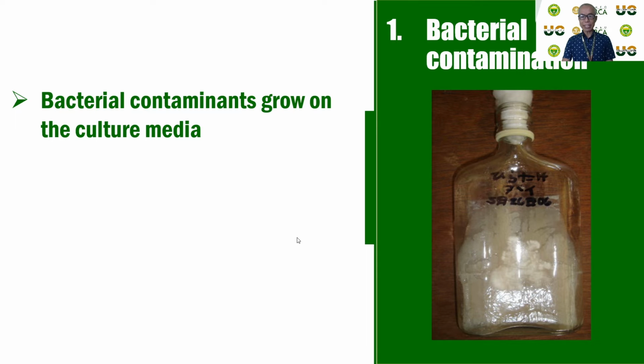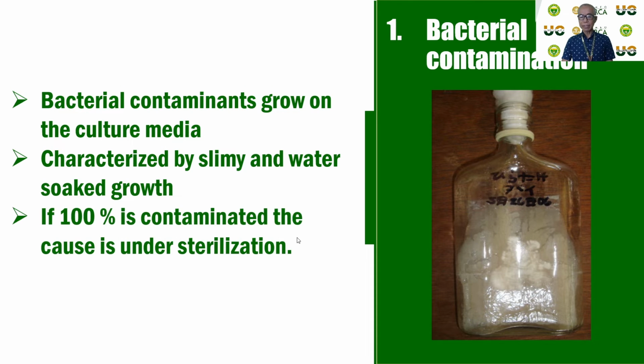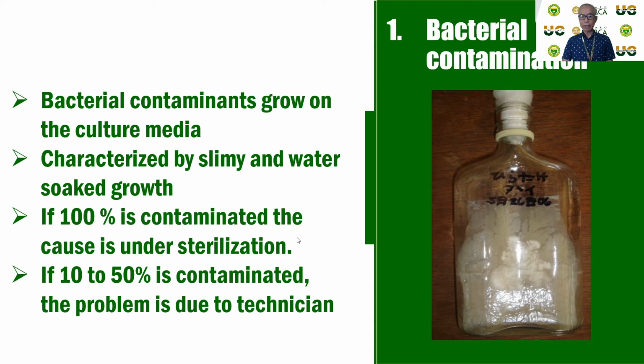If 100% is contaminated, the cause is under-sterilization. However, if 10 to 50% is contaminated, the problem is due to the technician. He has to improve his skills and practice proper asepsis.